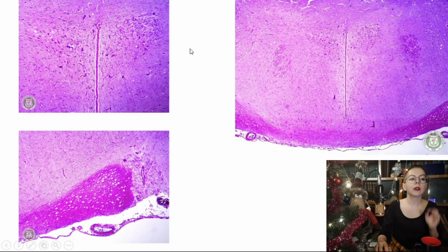Then this is the hypothalamus with its third ventricle in the middle and butterfly-shaped wings. These are the paraventricular nuclei, and close to the chiasma opticus, these are the supraoptic nuclei. Actually, this specimen usually we do not include in the exam, but you have to know. It is also difficult to confuse with any others, so if you know, you recognize.